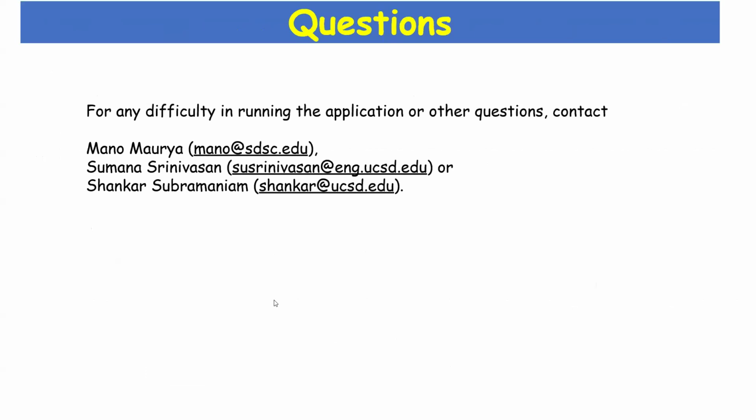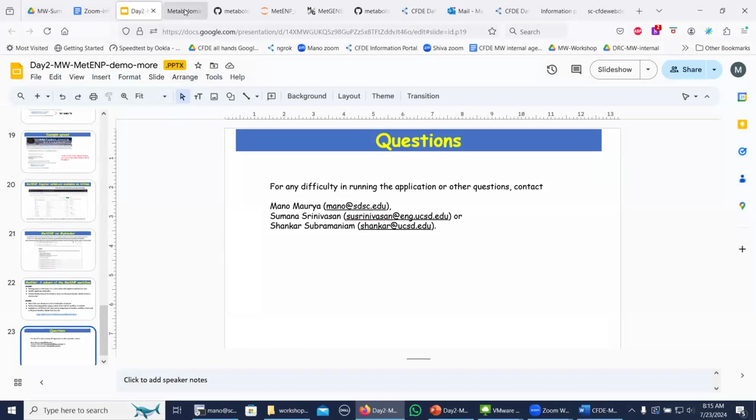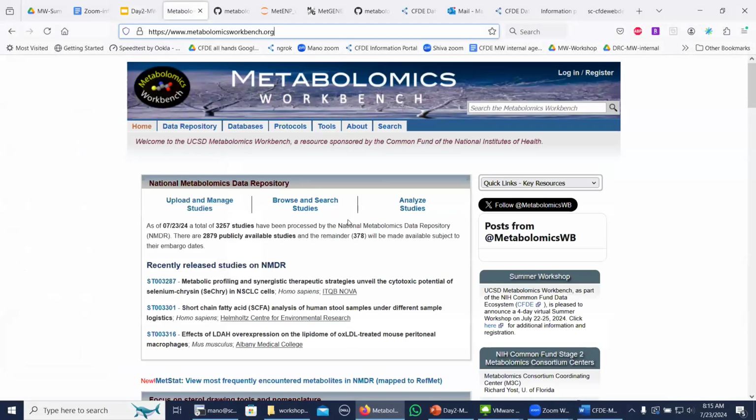So with this, I conclude the presentation part. Now I will go briefly to the GitHub page for MetENP and also to the Metabolomics Workbench website and provide a demo of MetENP. So let me go to the Metabolomics Workbench website.